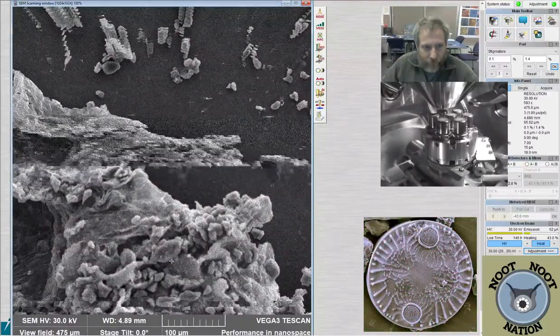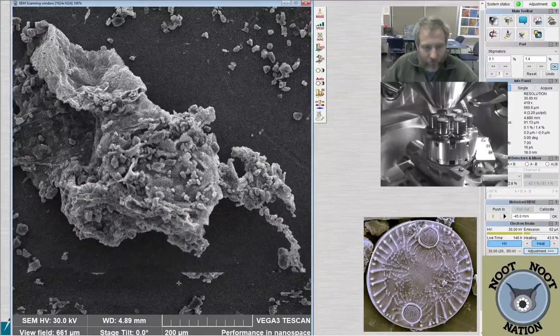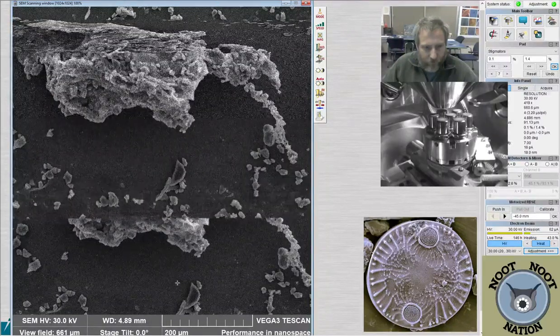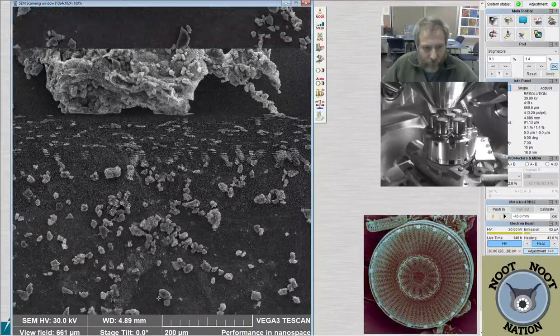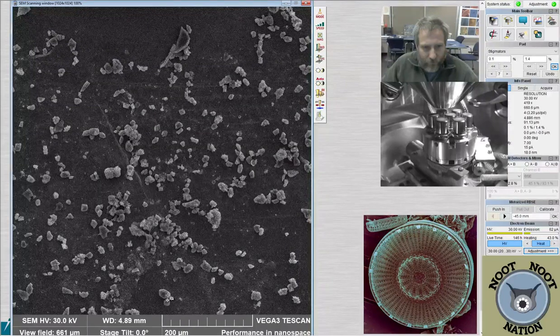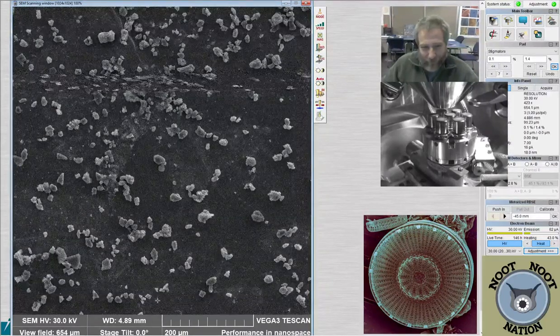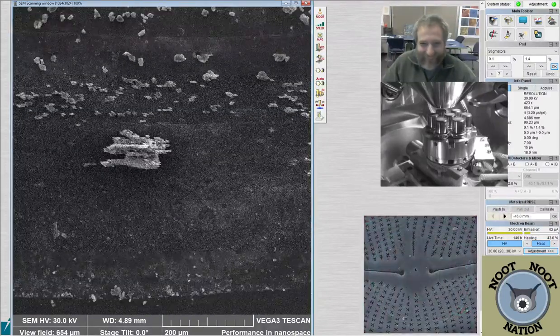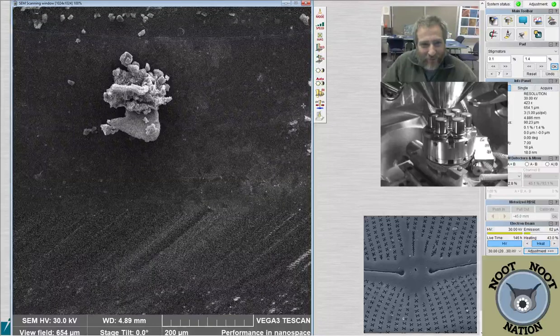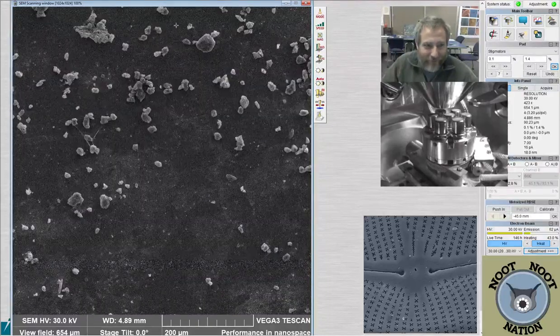That is a big chunk of something. Piece of plant. Just as a caveat, when I say big, it's big relative to the diatoms we're looking at. Nothing that we're looking at is big on the SEM. It's all little. It's just a matter of how little.